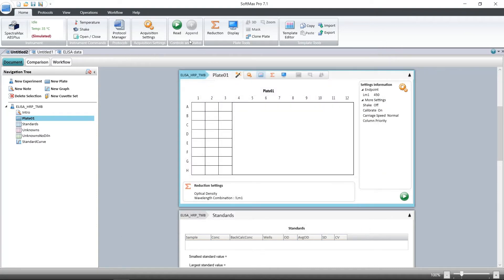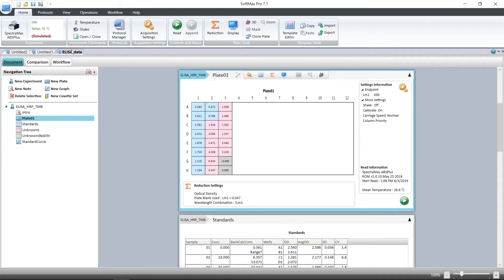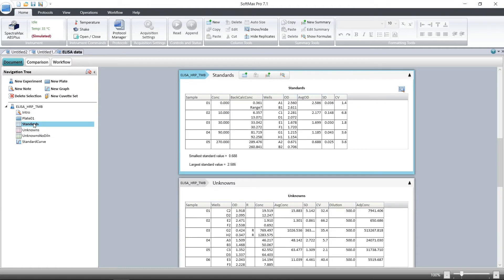Now we're ready to read. This is a template that's already been filled out so that all the group tables are populated, including the standards which are shown here.